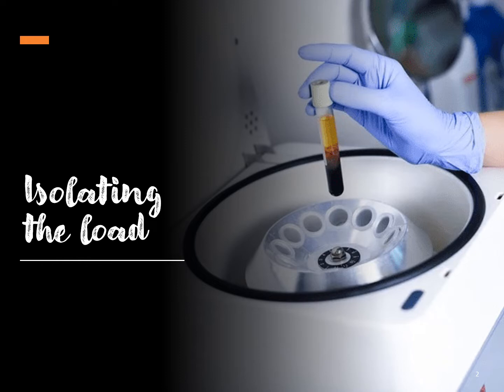So once you have the lysate, from which you have already removed the cellular debris, what you have is referred to as the load. What is the load? Your protein of choice which you will be purifying will probably have some tag with the help of which you will purify it, or you might make use of its physicochemical characteristics, like for instance its overall charge, to purify.